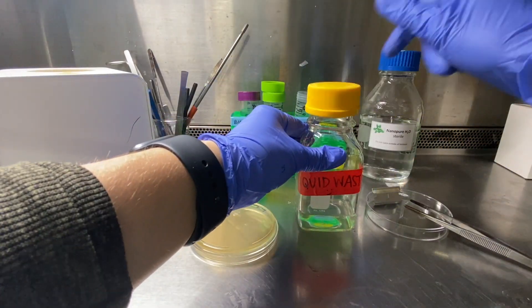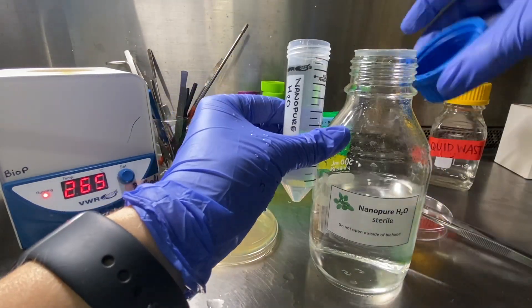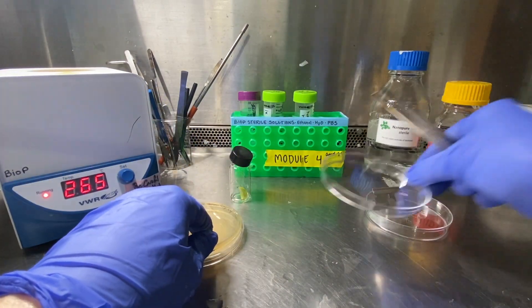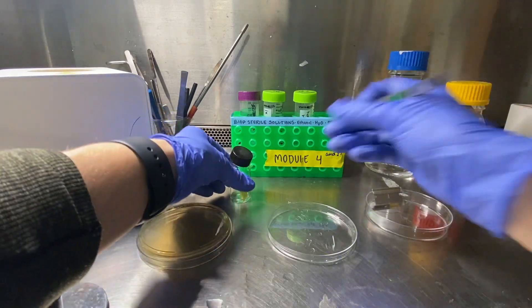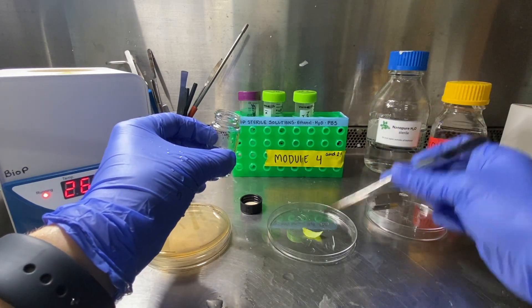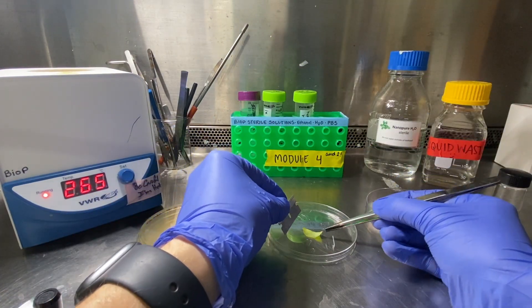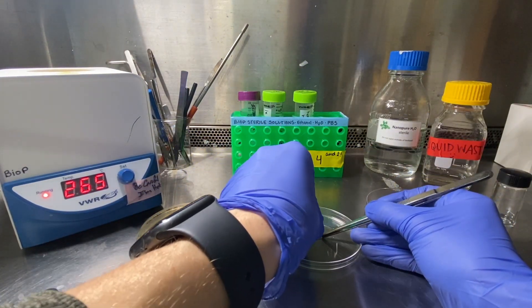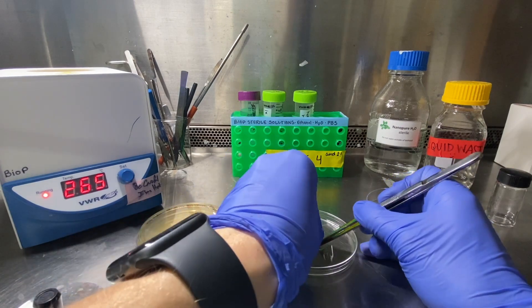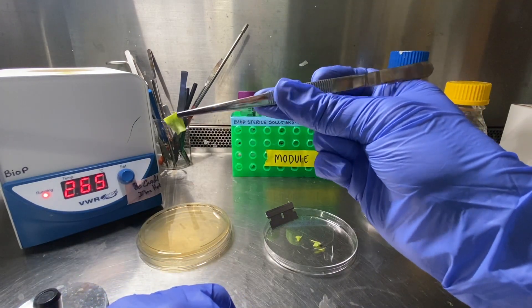It's also nice to your peers to refill the water if you used most of it. Now we are ready to cut some fresh edges onto our leaf. Remove the leaf from the glass vial using the forceps, and you can cut the edges with the razor blade. I like to hold the leaf steady with my forceps and just drag the razor blade across the leaf to make a little square.